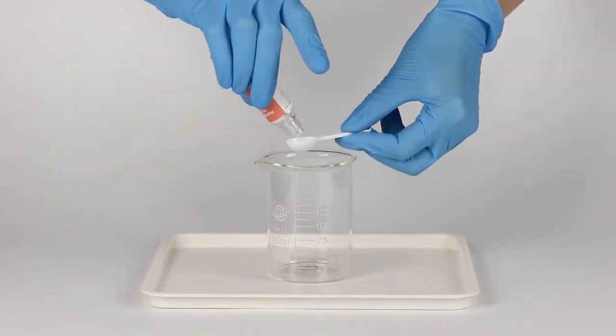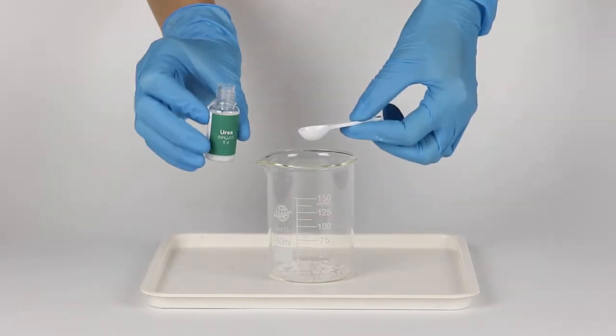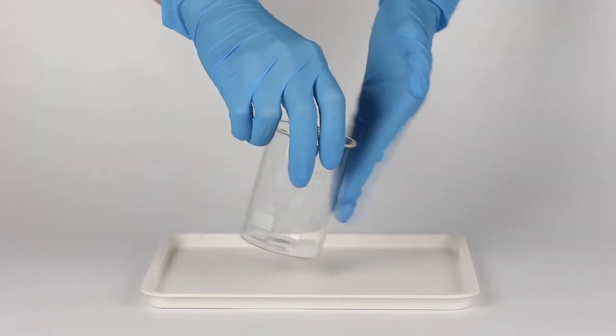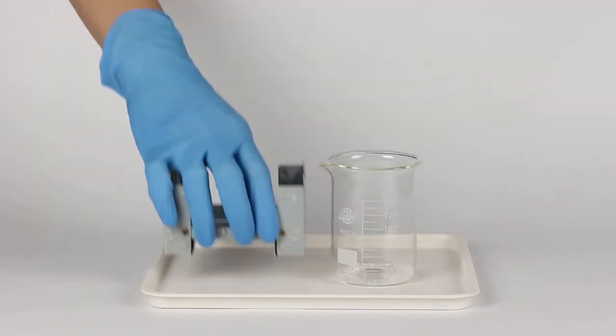Pour one big measuring spoon of sodium hydrogen sulfate and one big spoon of urea into the beaker. Tilt the beaker to move the mixture to the corner. Put three candles into the stove.